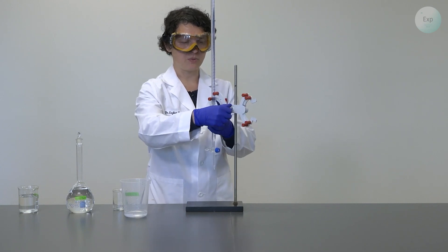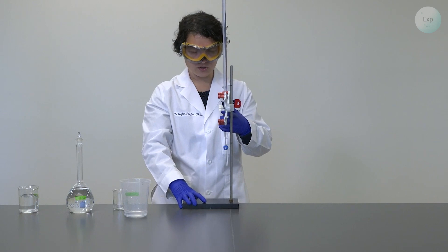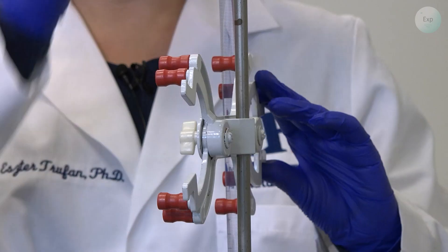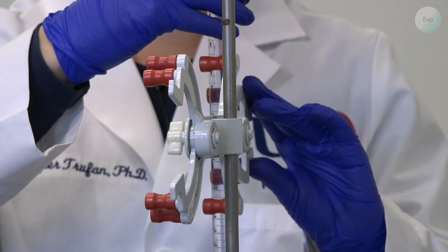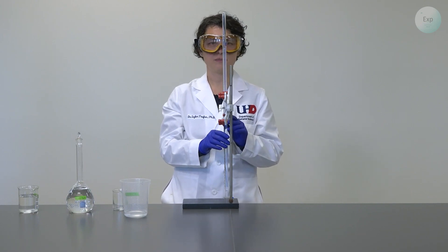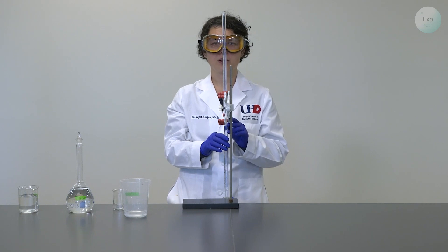So just like with any other measurement, we want to make sure that we bring the meniscus of our solution in the burette to our eye level. And that may require some adjusting of the position of the burette. So we lower it down, we make sure that the numbers are facing us, and that the burette is standing straight. And when we look at it, we will record the volume as is included.